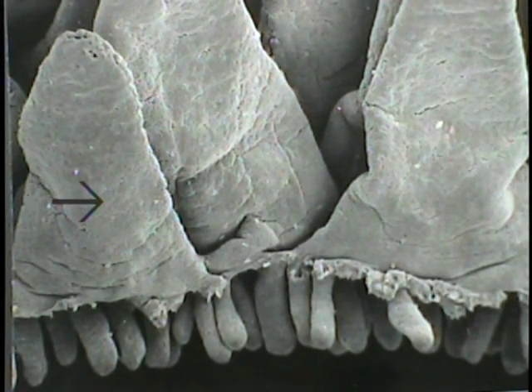This very interesting scanning electron micrograph is from Professor J.E. Magny of the University of Minnesota in Minneapolis. It's a digested specimen of the mouse intestinal mucosa, and what it shows is the intestinal villi from the proximal duodenum that are quite spatulate, quite well developed. And what he's done is digested away the underlying lamina propria.